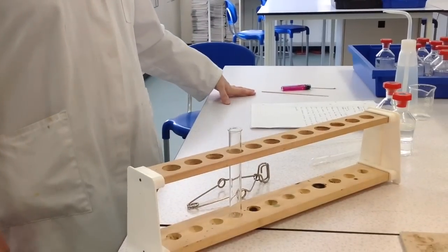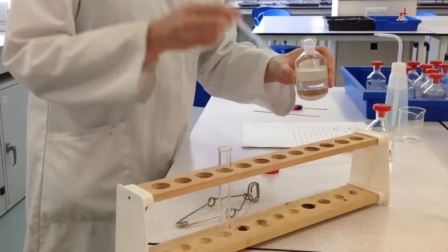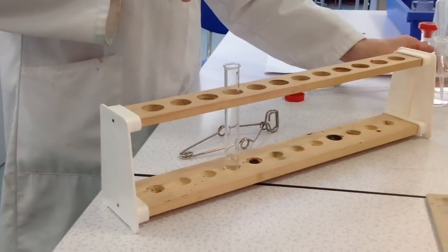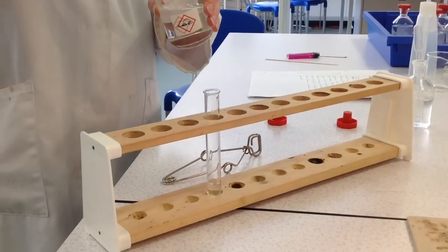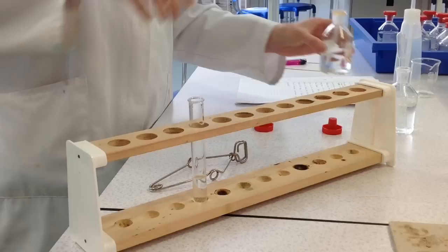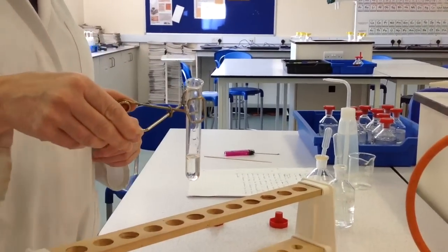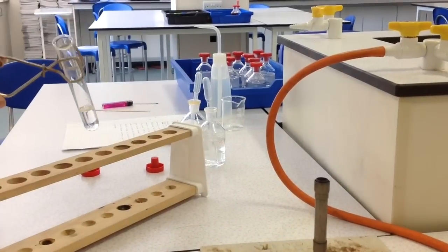Okay, finally, I'm going to show you the test for the ammonium ion. First, I'm going to put some ammonium nitrate in a test tube. And then I'm going to add some sodium hydroxide solution. Now I need to heat this gently, so I'm going to hold my test tube in some test tube holders, and I'm going to heat it very gently over a blue flame.